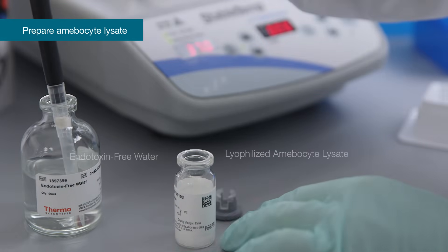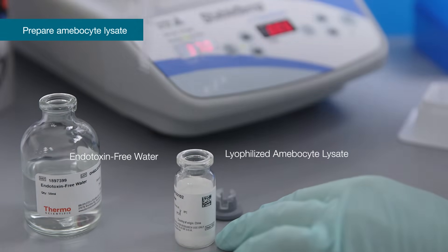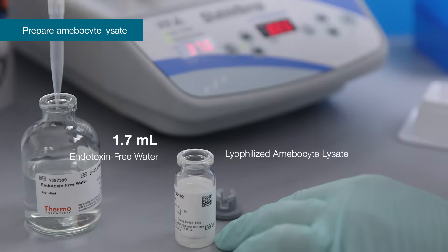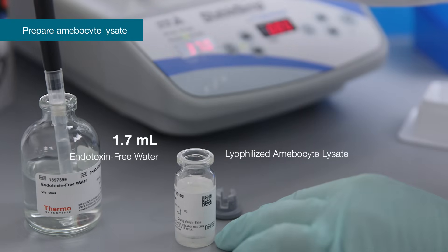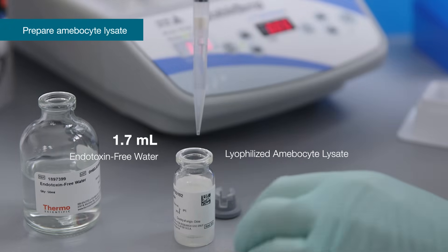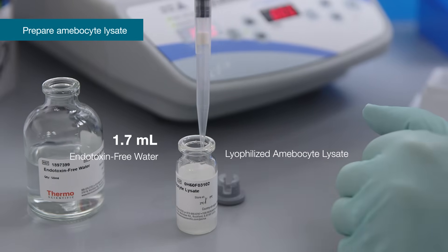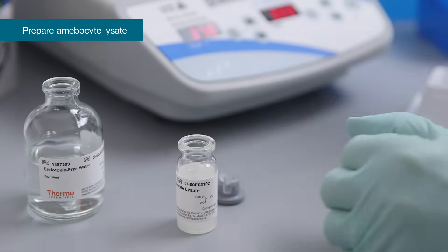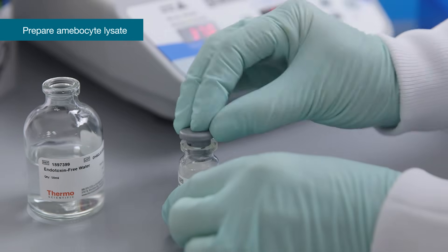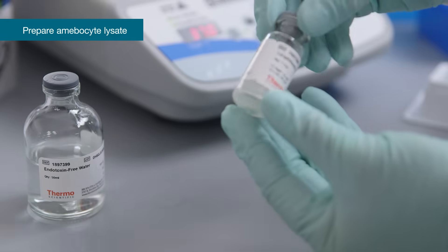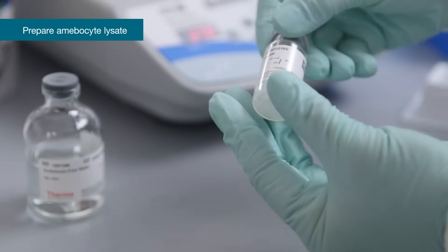Reconstitute lyophilized amebocyte lysate immediately before use with 1.7 ml of endotoxin-free water and swirl gently to dissolve the powder. Do not vortex. Gently invert end over end to recover all of the powder from the sides and the cap of the vial. If more than one vial is required, pool two or more vials before use.